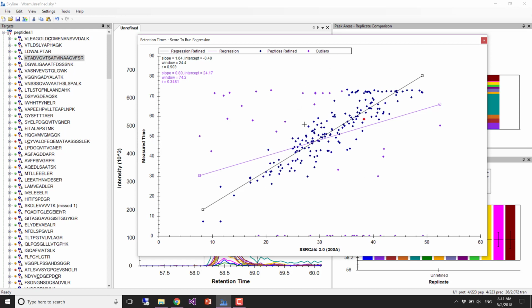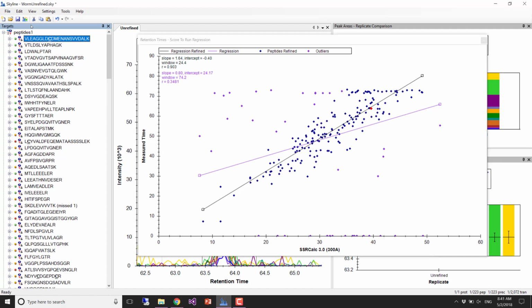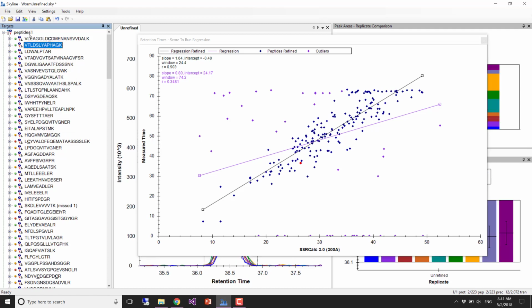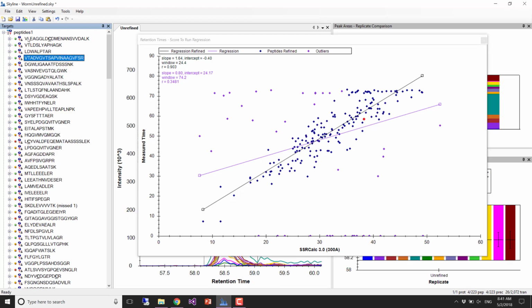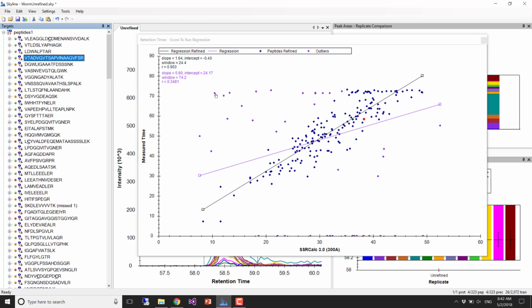Okay, so you can see that the little red dot represents our selection, and we could quickly select our first three things, or those four that we thought looked pretty nice, and see that they're all fairly close to the line. You can just watch the red dot move around and say, oh, okay, that's the selected thing. And so the first four that we've decided we'd like to keep are also really close to the line. In this graph, you can click on anything you want.